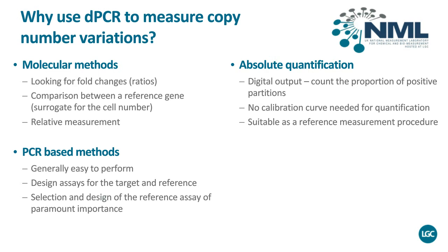And this makes it suitable for a reference measurement procedure, because it's not tied in to, say, UV absorbance or any other method. It's down to the SI unit of counting, which also means it's suitable for trace detection. So if we're looking at those sort of borderline cases of HER2 amplification, we're likely to have a method here that could detect those small, subtle changes.